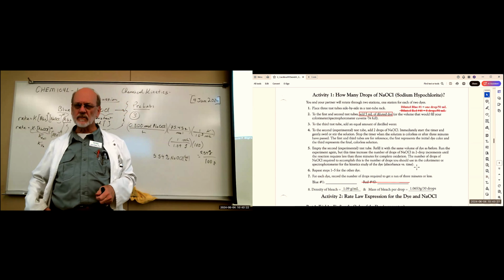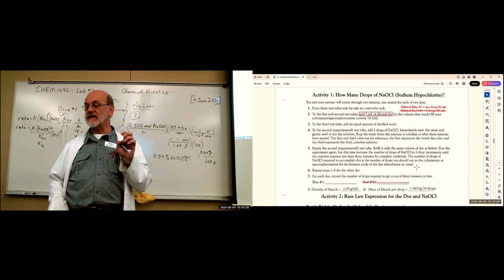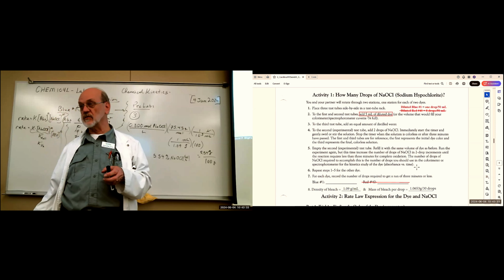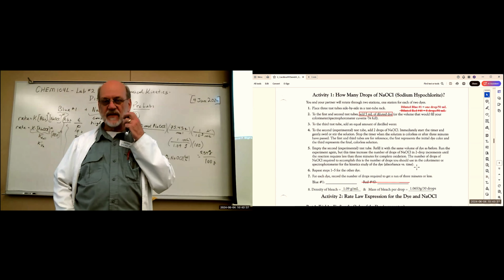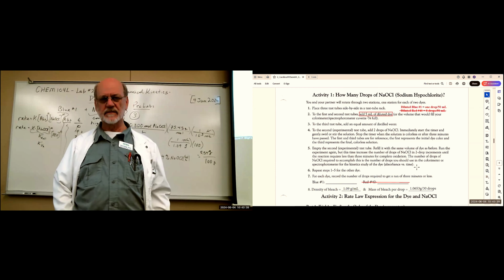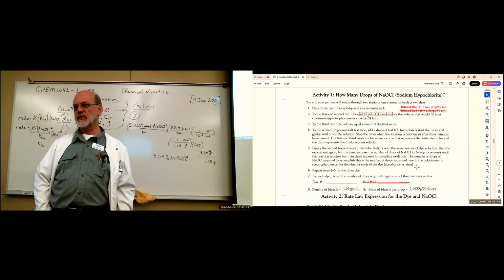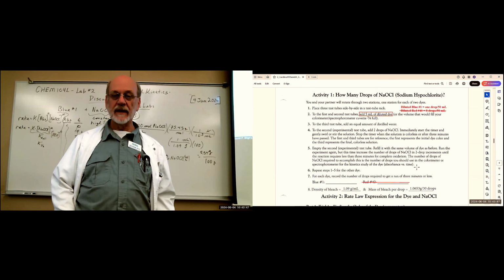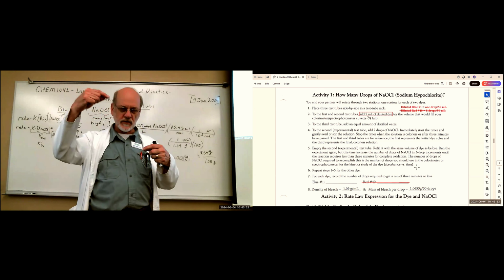The only way we could manage it quicker is to tie the spectrophotometer into a data recorder. Then you can get the data from the instant you add the bleach. I haven't done that. I don't have the funds. I guess I could apply for a Perkins purchase for a data recorder. Anyway, you're going to watch it and record all those absorbances.